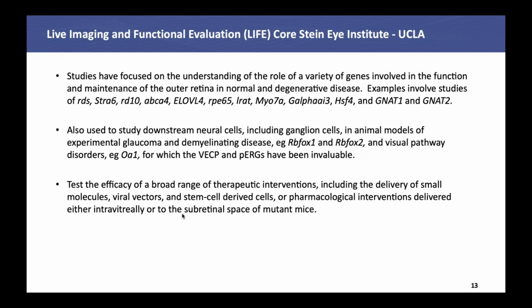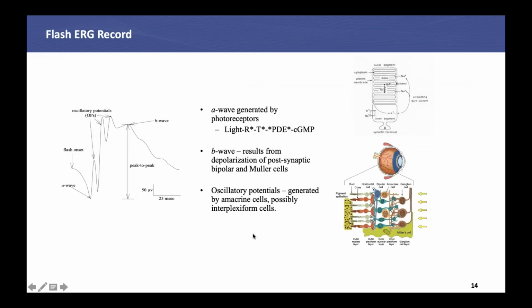So let me go to the next slide. Okay, just for those who are new at this, and I don't know what your level of sophistication is, but here's basically an ERG response, and Jeff had showed you this earlier. We can dissect out the components of the flash ERG to reveal function of the photoreceptor, which is defined by the A wave.